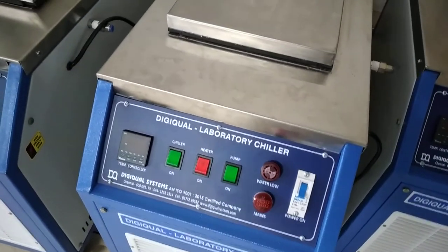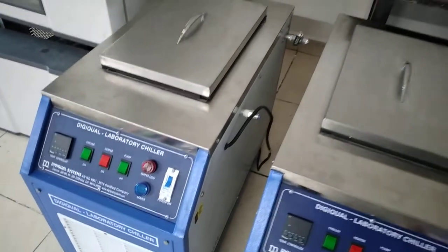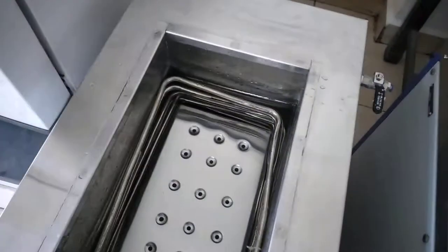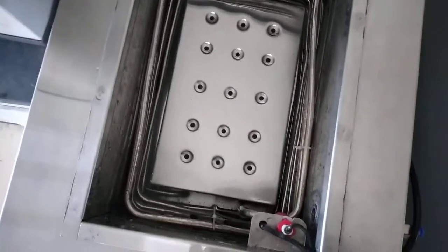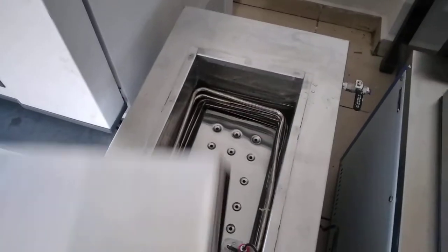This is the 25 litre capacity chiller. This is a big size.